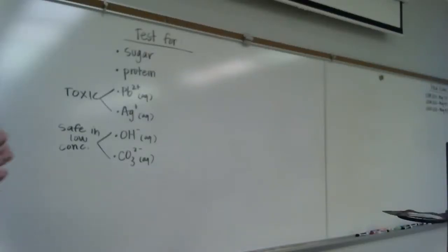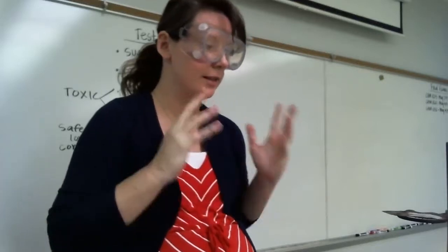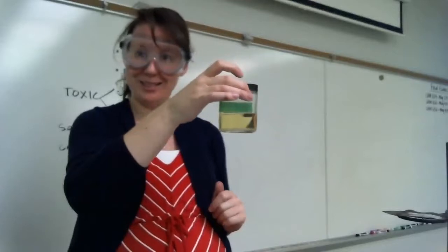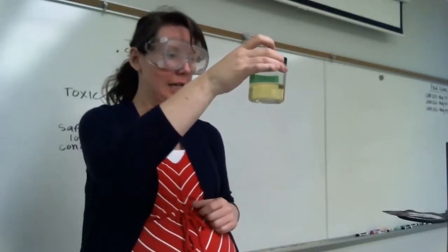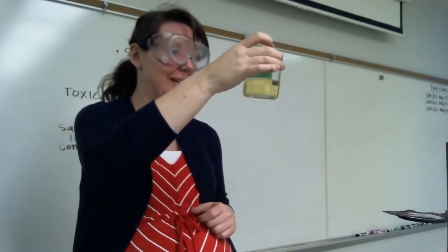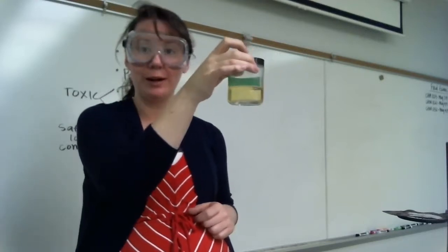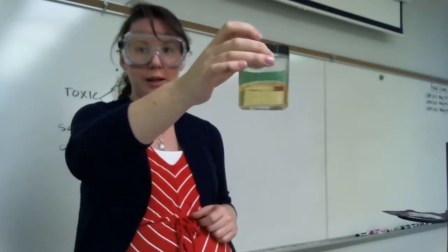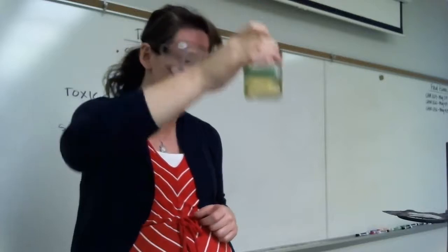All right, so we are going to be doing some water quality tests, and this is a sample of water that I got from our beloved campus lake. Not recently, because I would probably fall in. I've got a thwarted center of gravity right now, but before that, I went down and got a sample from our campus lake. And as you can tell, it's kind of gross looking, right? There's algae, there's all kinds of stuff floating around in there.